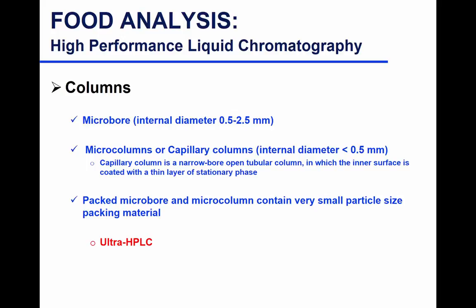They have very high resolution because you have a very small amount of stationary phase, so the mass transfer is really high and equilibrium happens very fast. These are typically your ultra HPLC. When you hear ultra HPLC, these are columns that are either capillary or microbore columns. Micro column, not the microbore, micro column.